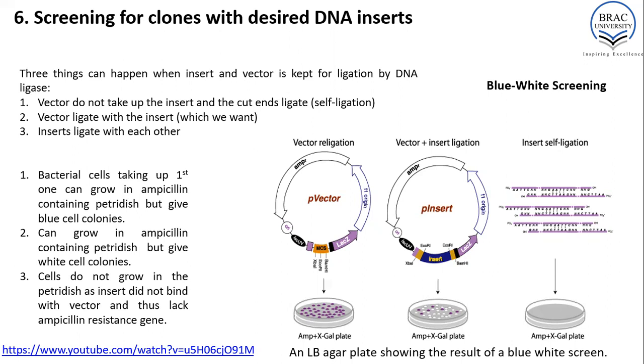So this is the basics of the blue and white screening. This is also called alpha complementation.